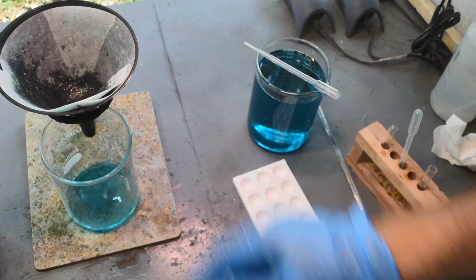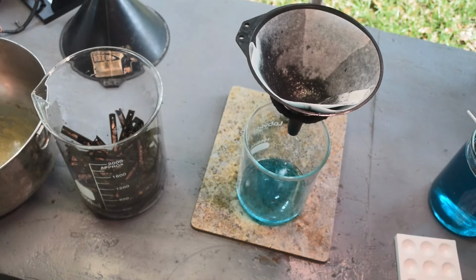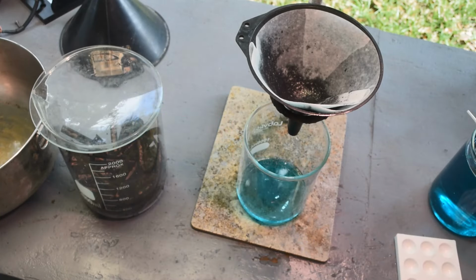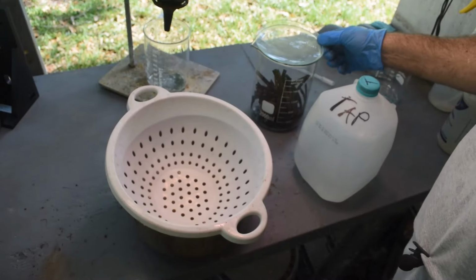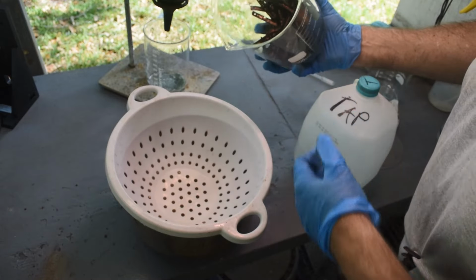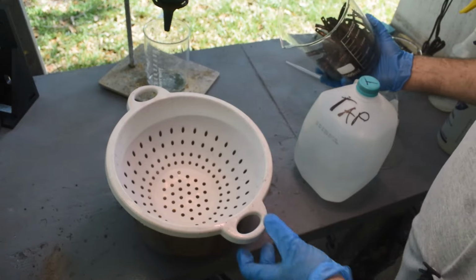Okay, so I'm going to set this filtration aside, and we will work on recovering the rest of the palladium flakes that are down here amongst all these bits of circuit board stuff. So I will get set up for that. All right, so as I've said a couple times now, we're going to try using a physical separation technique to separate the palladium from the waste material in here.